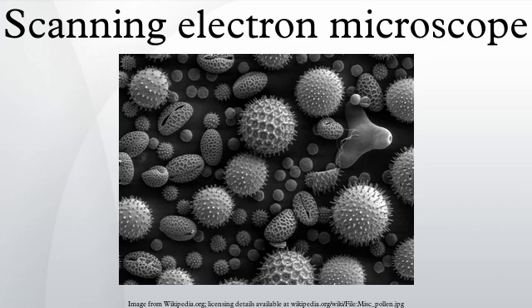Environmental SEM. Conventional SEM requires samples to be imaged under vacuum, because a gas atmosphere rapidly spreads and attenuates electron beams. As a consequence, samples that produce a significant amount of vapor, for example wet biological samples or oil-bearing rock, must be either dried or cryogenically frozen. Processes involving phase transitions, such as the drying of adhesives or melting of alloys, liquid transport, chemical reactions, and solid-air-gas systems, in general cannot be observed. Some observations of living insects have been possible, however.